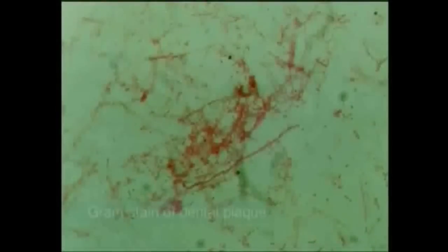Examination of the stained smear at high magnification will also allow you to see the shape of individual cells, and any other characteristic features such as arrangement of cells or the presence of spores.